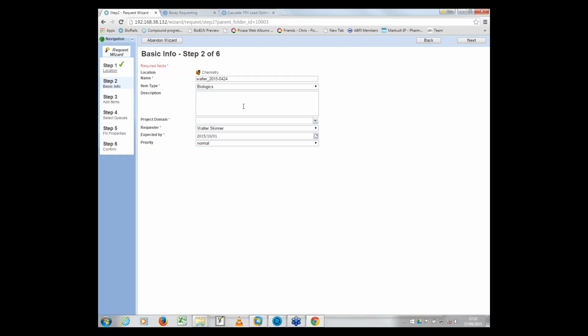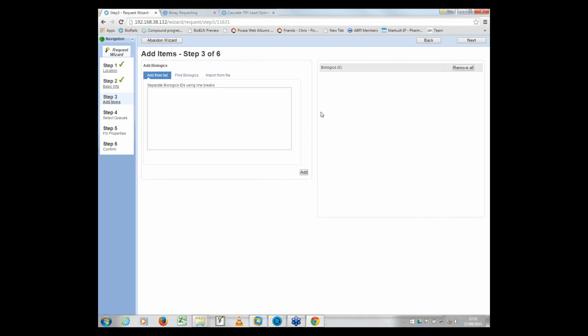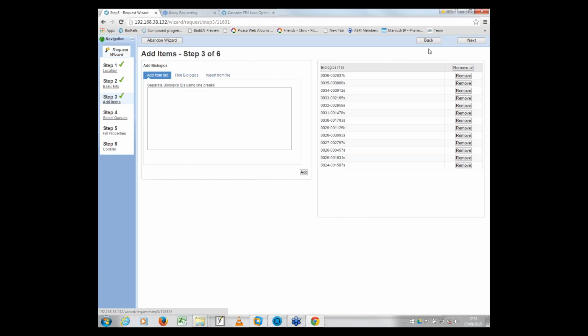So what we're going to do is submit a set of biologics. So we'll say please characterize, and I'm going to submit them again on behalf of a particular project. And I might want to say when I'd like the results by. So I'd like these by the 15th of October. And then I'm going to paste in a list of different biologics lots. So I've got a list here that I've pre-prepared. So I'll just paste those in and then add them to the list. So here you can paste in obviously a large list. If you've got a very large file, you can just import them from a CSV file, or again, you can go and look them up.